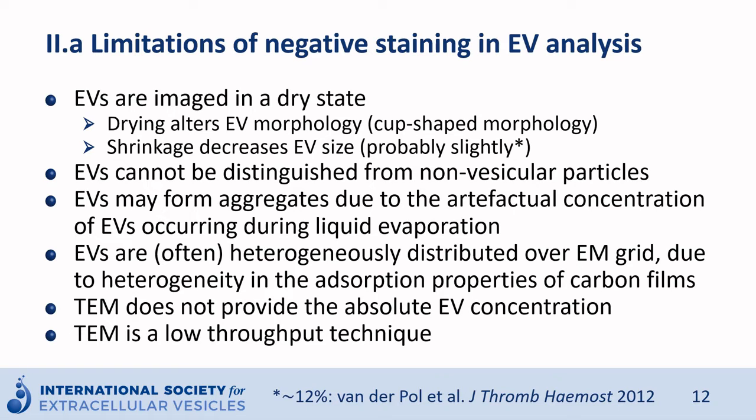EVs cannot be distinguished from non-vesicular particles, and EVs may form aggregates due to the artifactual concentration of EVs occurring during liquid evaporation. In addition, the distribution of EVs over EM grids is often heterogeneous, due to the heterogeneity in the adsorption properties of carbon films. And very important, TEM does not provide the absolute EV concentration.